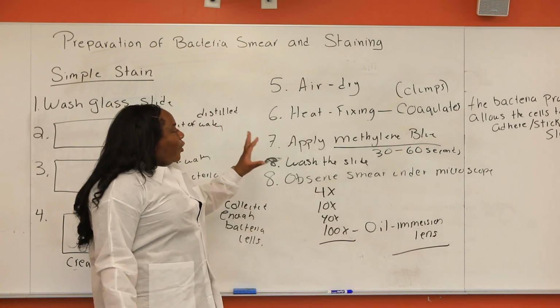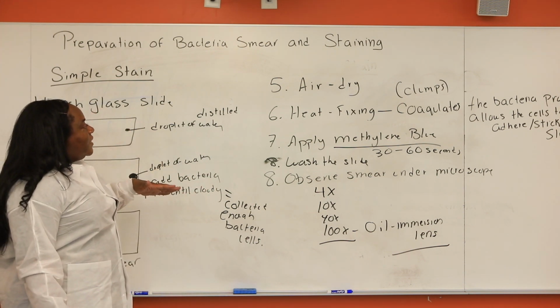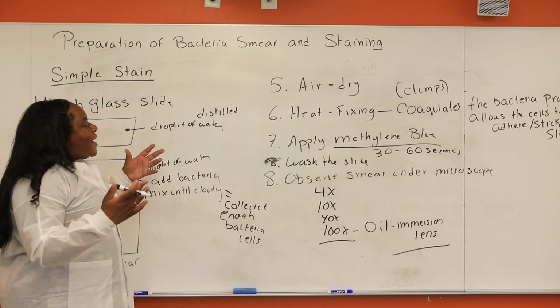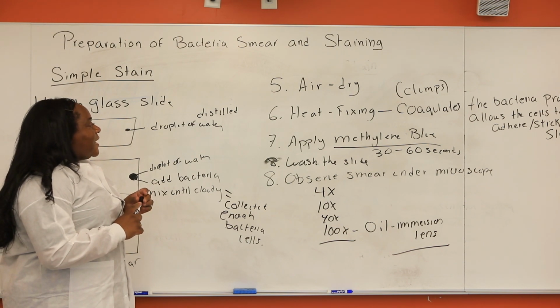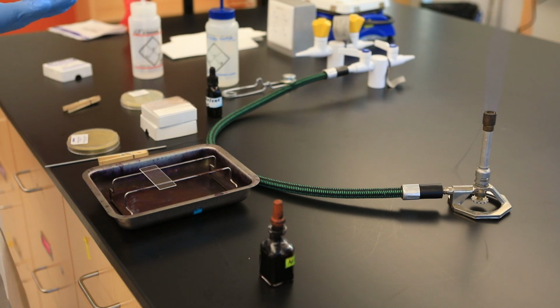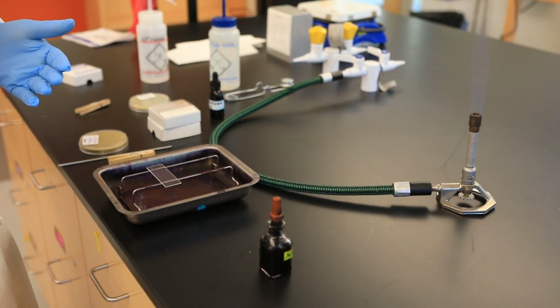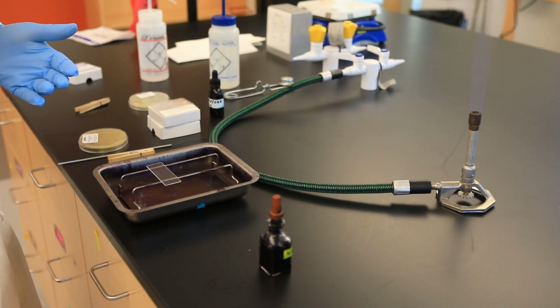Okay, so I'm hoping that this was clear, right? Going through the steps of the simple stain. So now we're going to finally actually conduct the stain. I'm going to show you how it's conducted. Perfect. So now I'm going to walk you through how you would prepare the smear and conduct a simple stain.